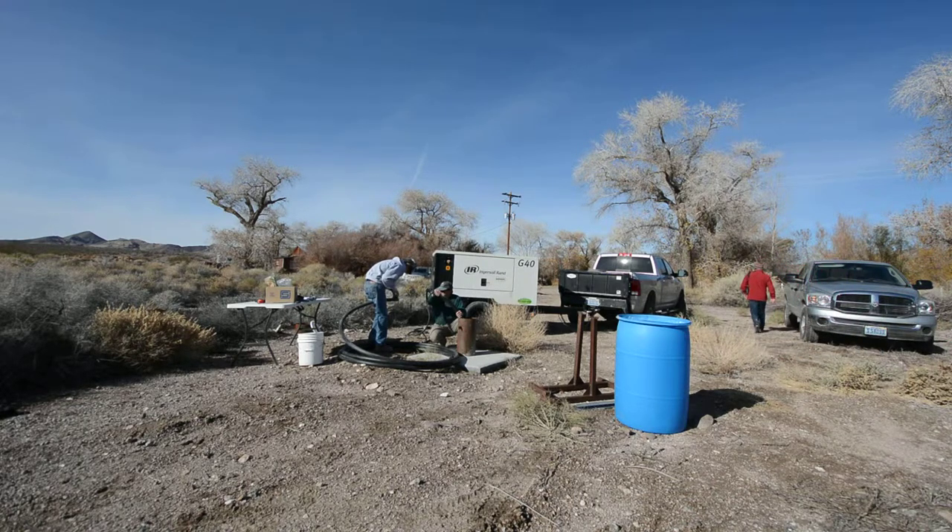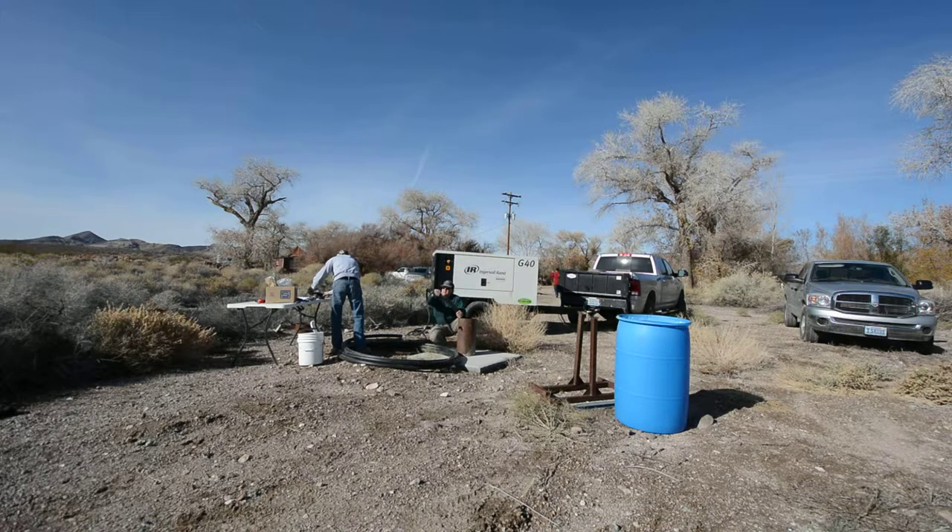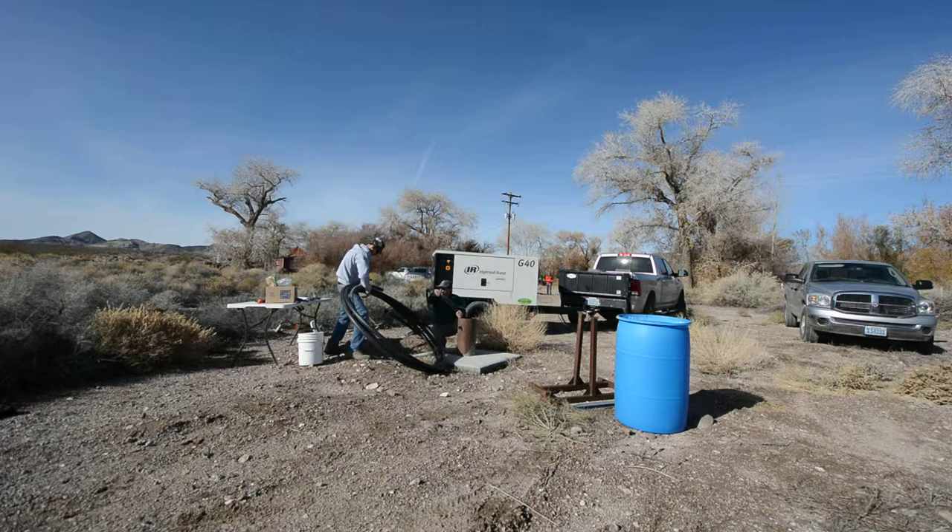We have no choice — we're going to have to use the same canisters anyway, so we're going to have to rinse them later. How do we get a rinse in here? If we fill both of them on the first time point, we have about 10 minutes before the second one. We'll have a manifold for them, so we have multiple things to fill each one independently.